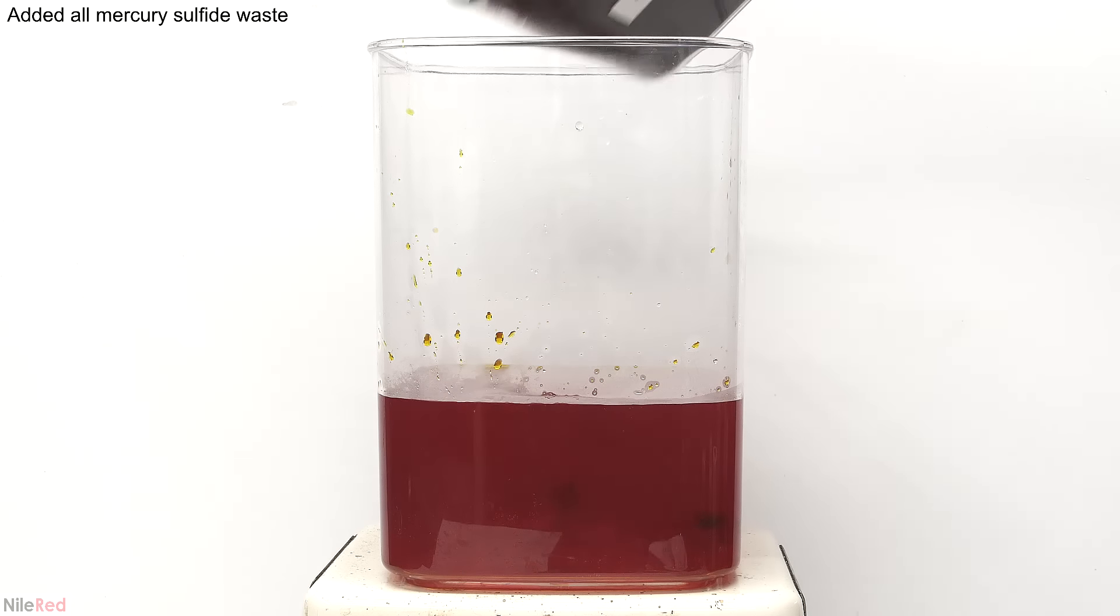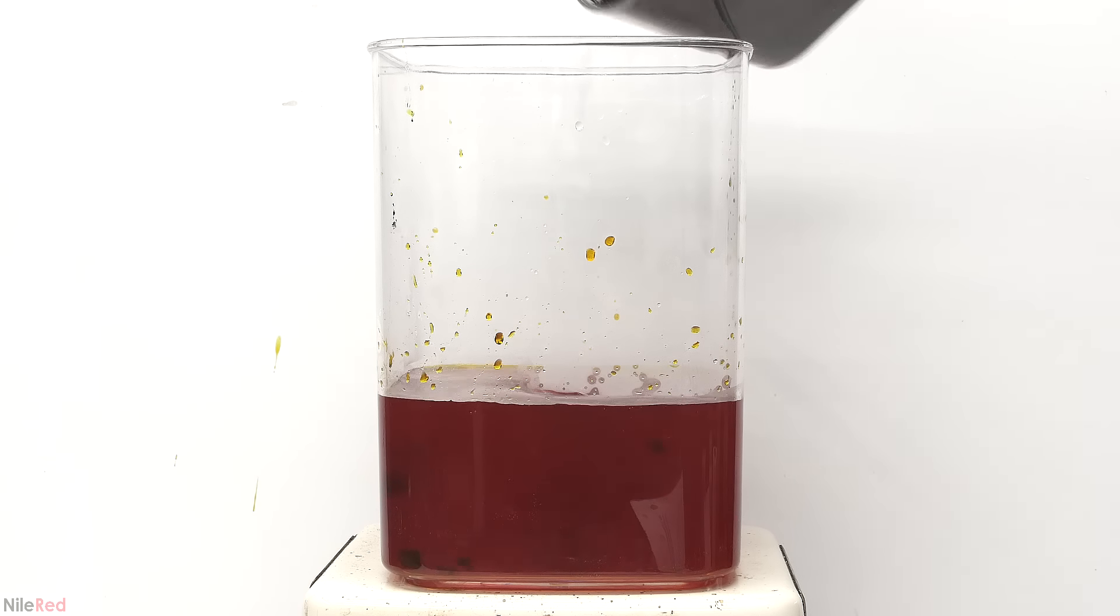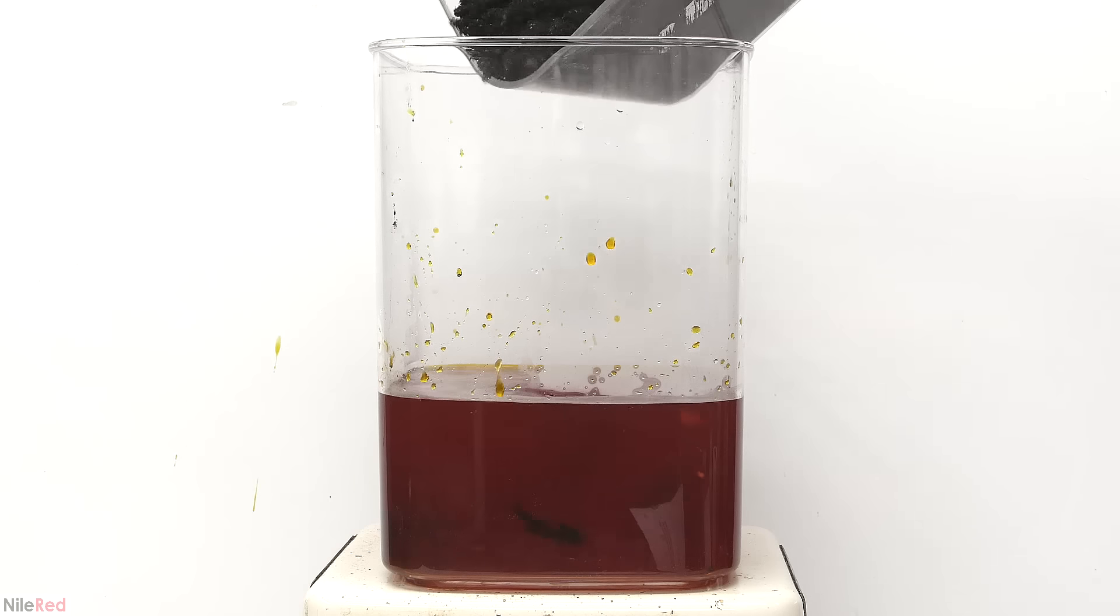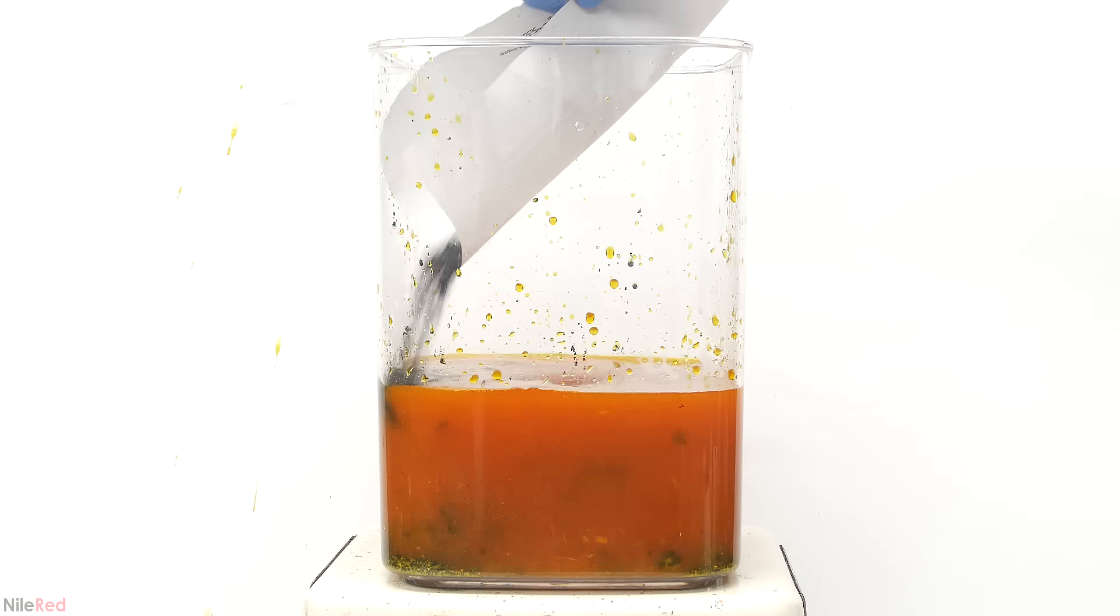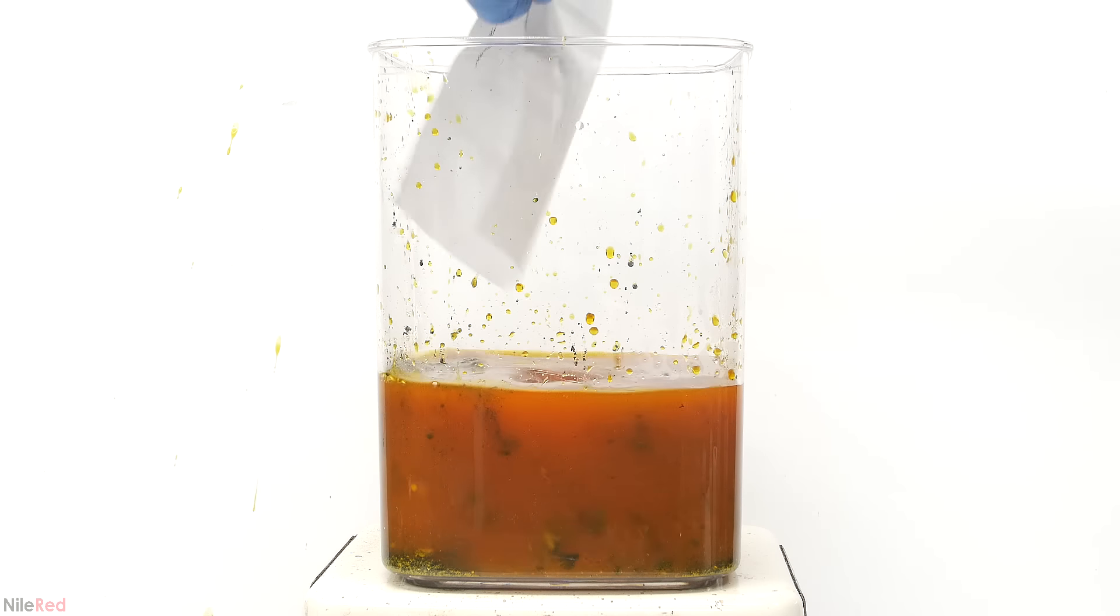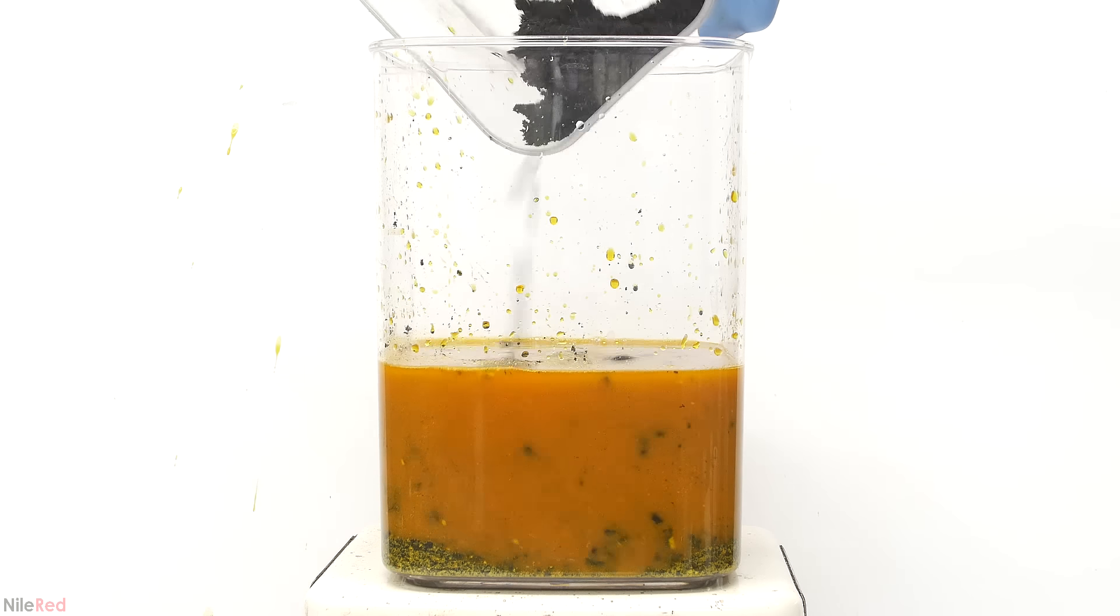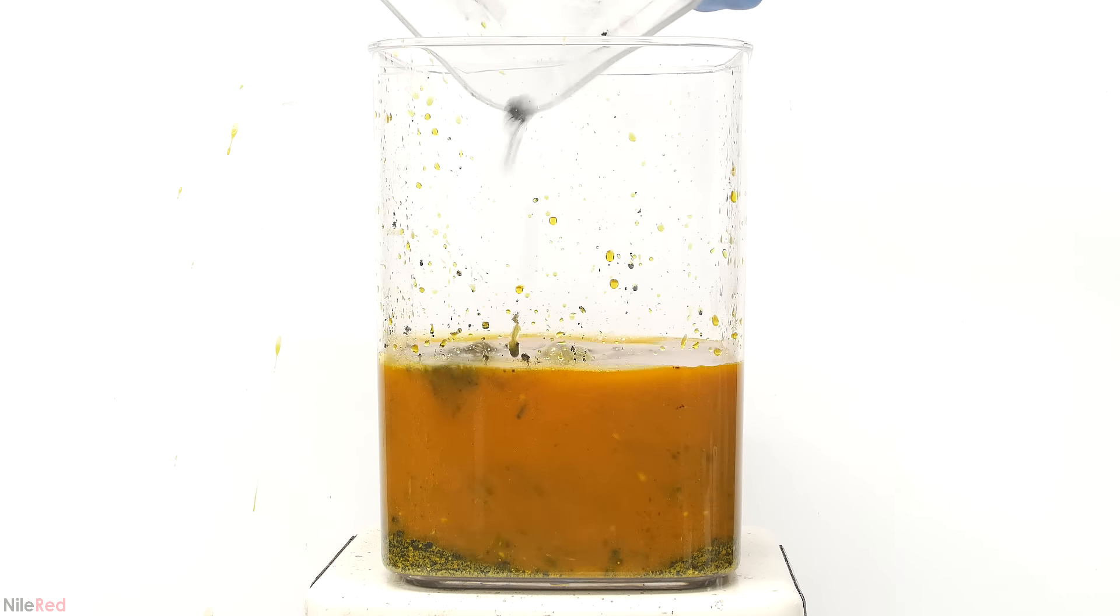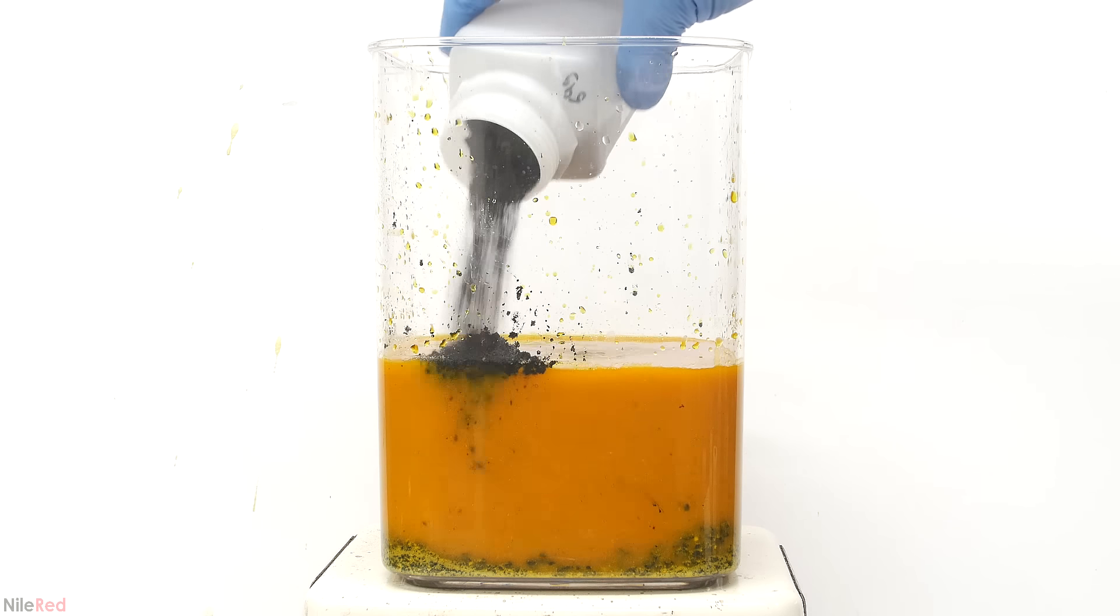The stirring is turned on again, and then I start to dump in the mercury sulfide. At first I tried to just dump it in directly, but it led to a lot of splashing. So instead, I had to transfer it in small portions to a piece of paper and then dump it in gently. As more is added, the solution slowly loses its red color and becomes more orange, and we also see some sulfur precipitating out.